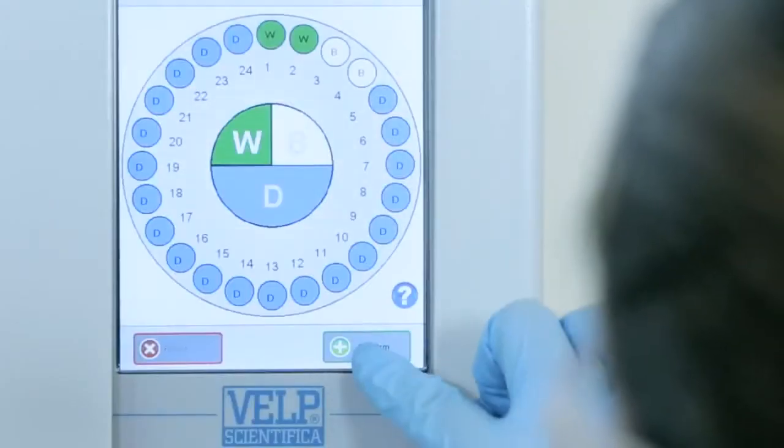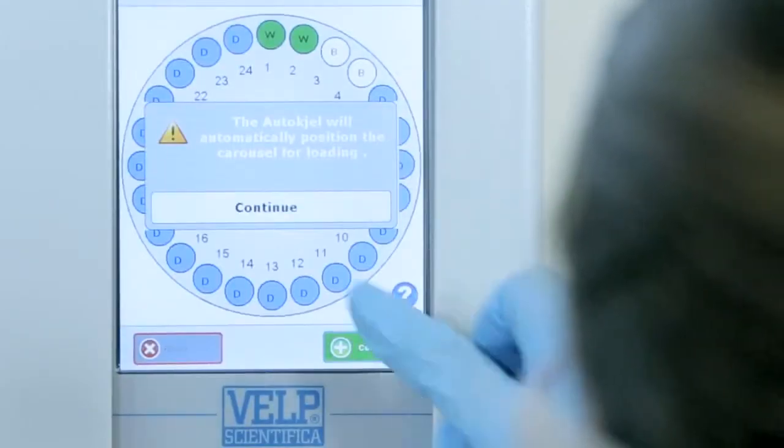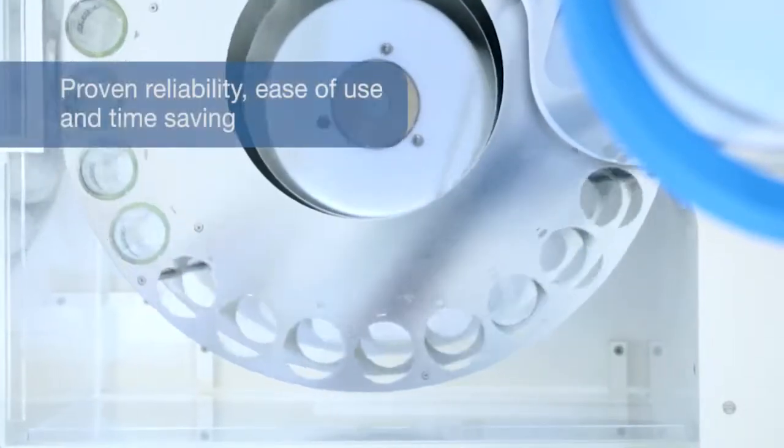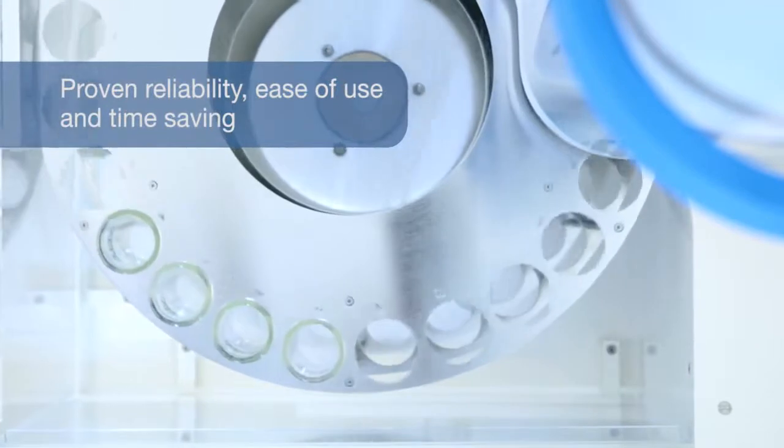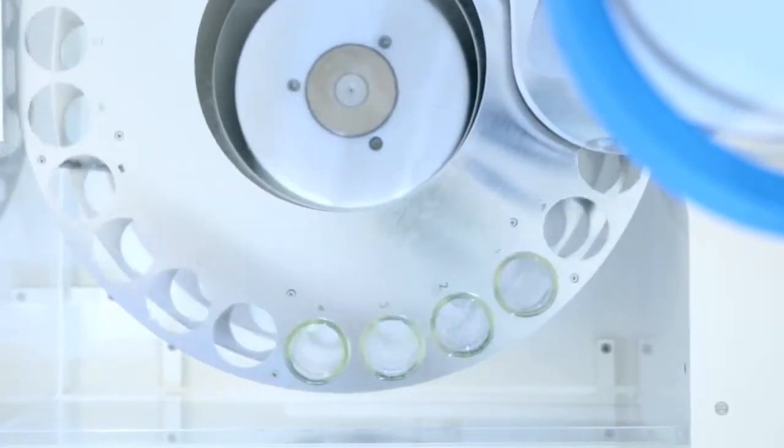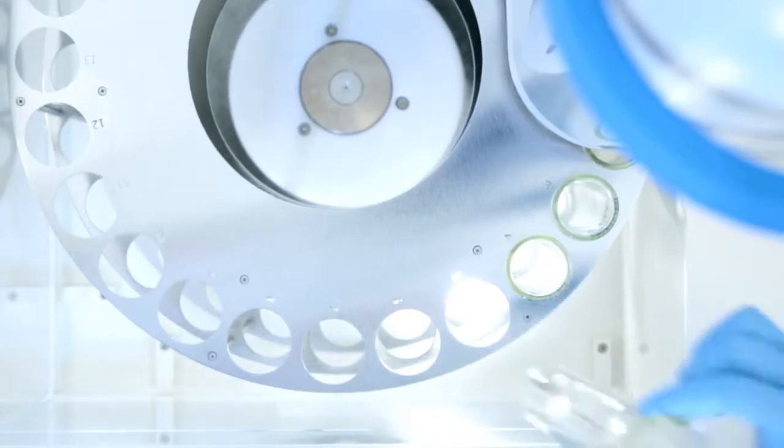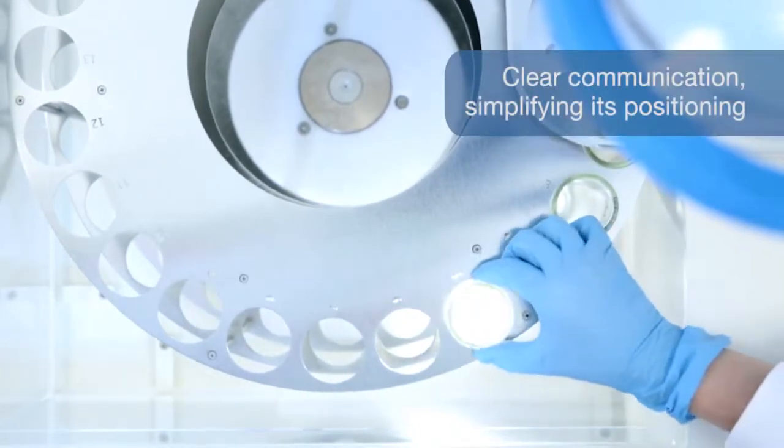When combining the UDK169 with the AutoKiel AutoSampler, you will be supported by proven reliability, ease of use and time saving for safer and simpler activities. A light shows where to load the digestion test tube, simplifying its positioning.